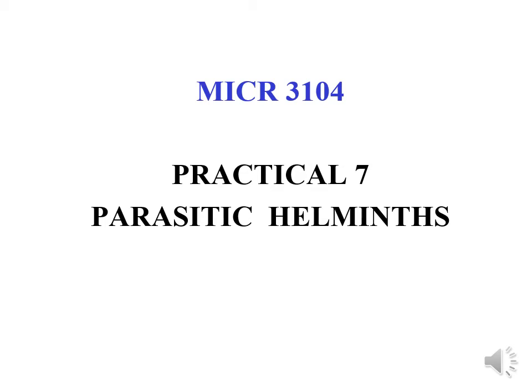Today we have comparatively a small and easy practical. It is mainly about parasitic helminths. I will try to keep it very short and precise.